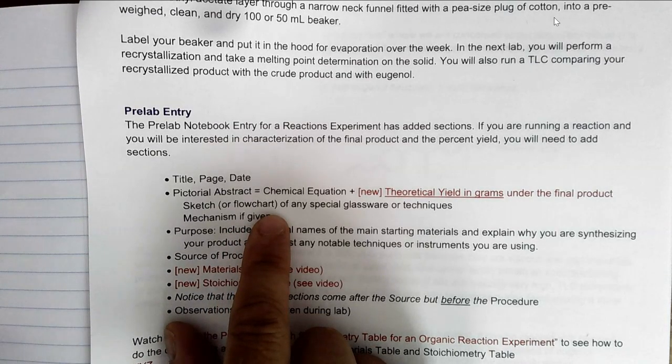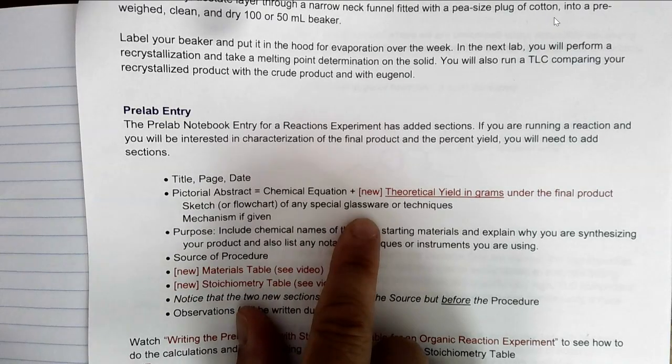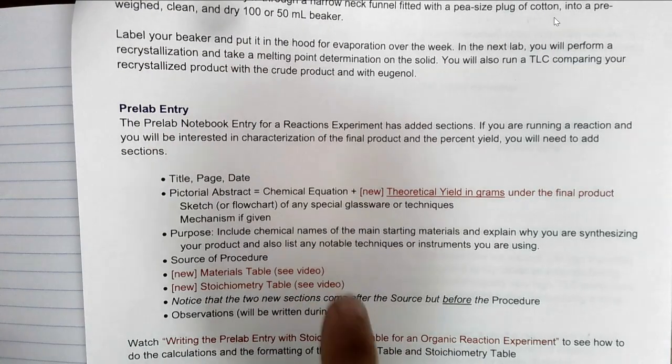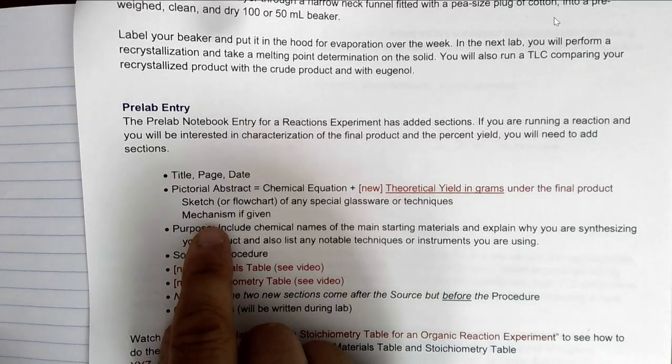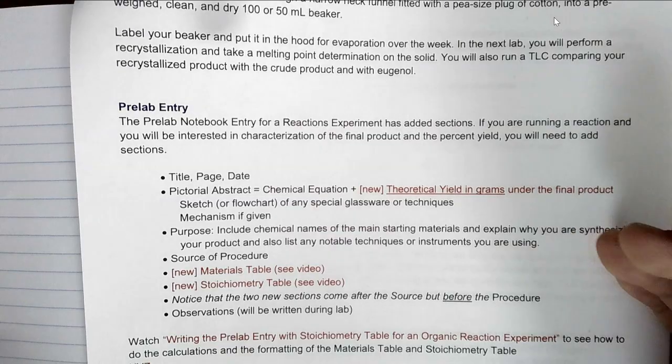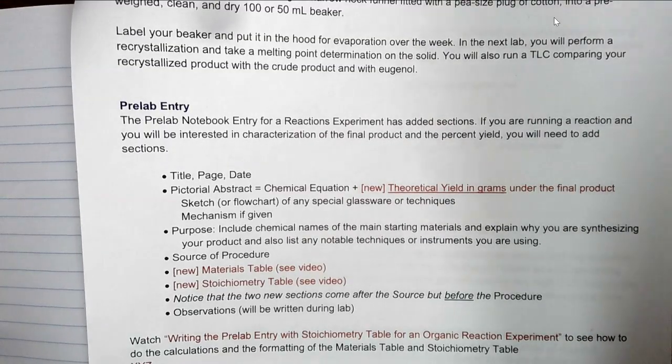If there is any special glassware or technique that you're using, you could sketch it, or some people like to draw a little flow chart. And if there's a mechanism given, you should draw it. For this particular reaction, we are not giving you the mechanism, so you don't need to draw it.